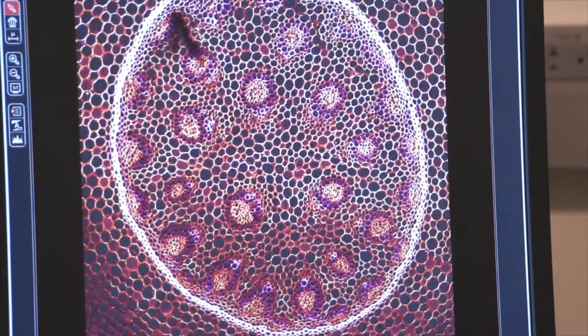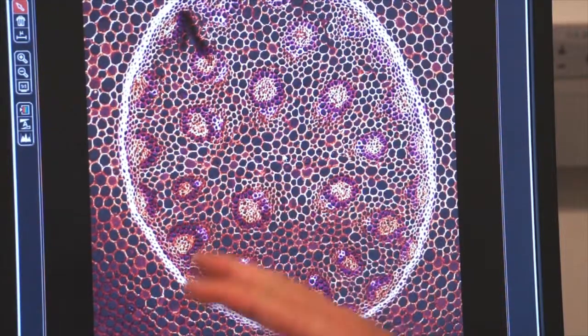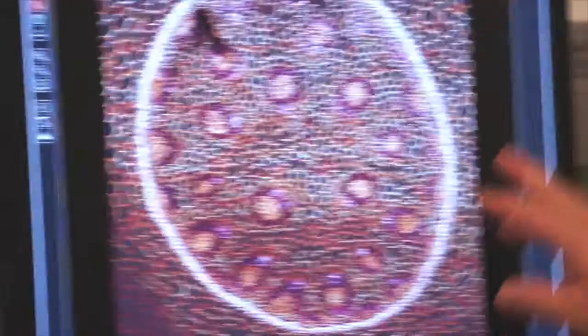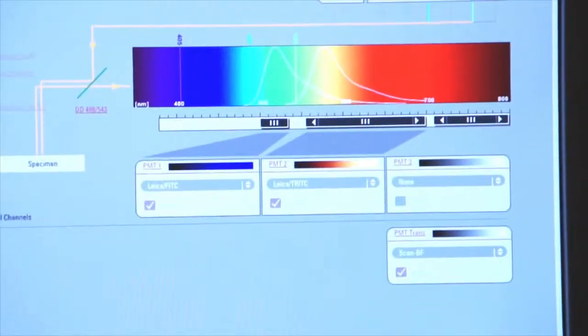Now you can see that my composite image is a lot different. So by changing the colors of the output of my photo multiplier tube, I can accentuate regions of interest on my image that I want to show in different colors.